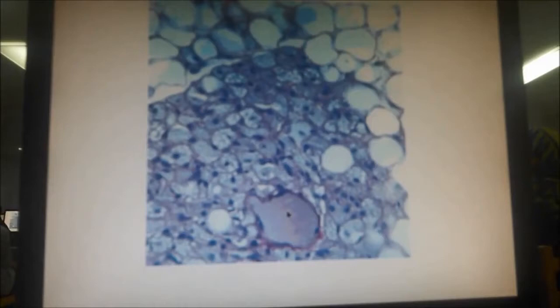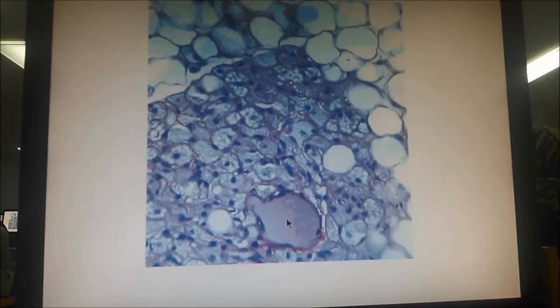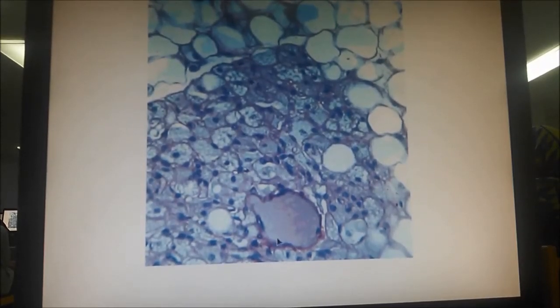There are two main reasons for the difference of color. First, the brown adipose tissue's main function is not the production of energy. It is actually the production of heat. Due to that, the cytoplasm of the cell contains a much higher amount of mitochondria. Mitochondria are acidophilic, thus it is darker. The second reason is that the brown adipose is much more richly vascularized, with more blood vessels. And the blood vessels give it the dark color, even grossly, even if you look at it with your eyes, because of the hemoglobin. So it is darker. Why is it brown? Two main reasons: a large amount of mitochondria, and second, it is more vascularized.